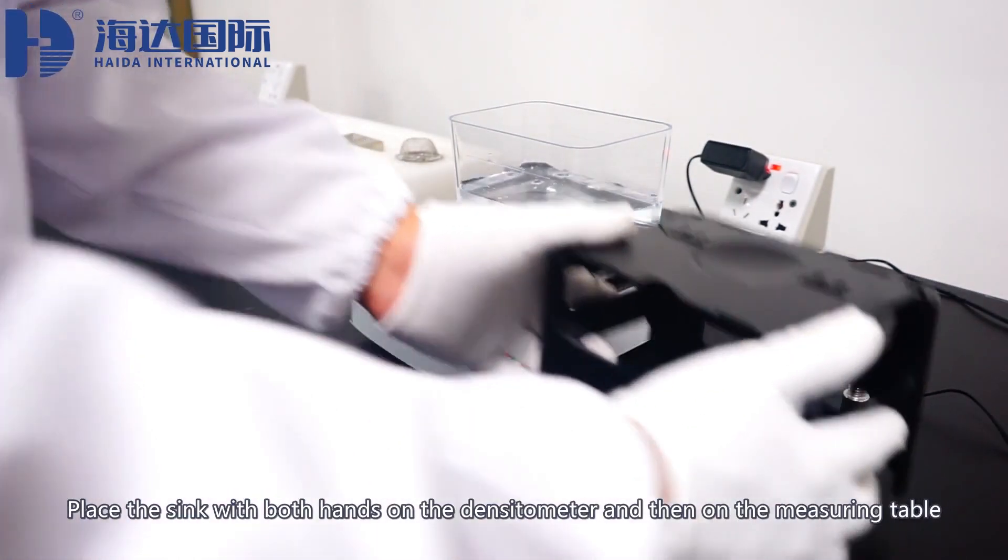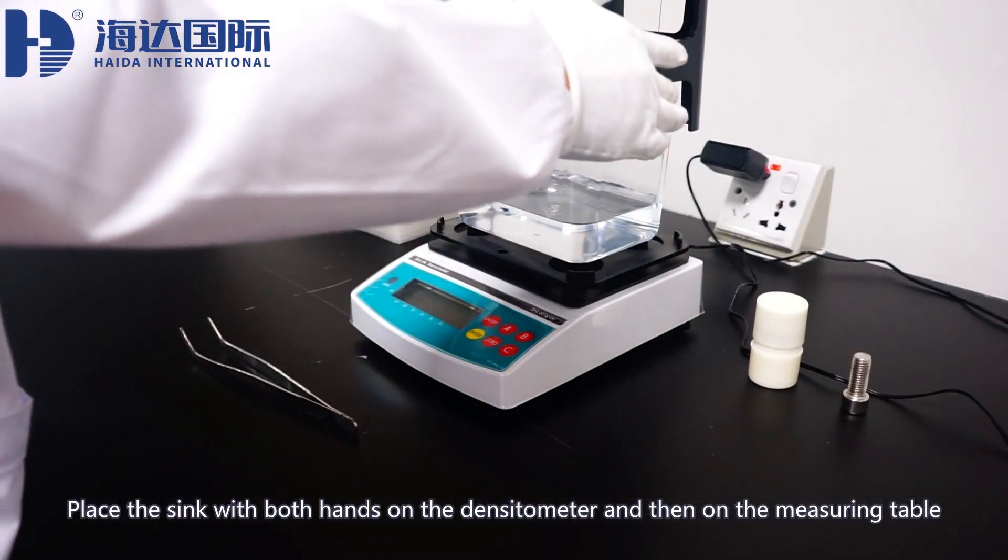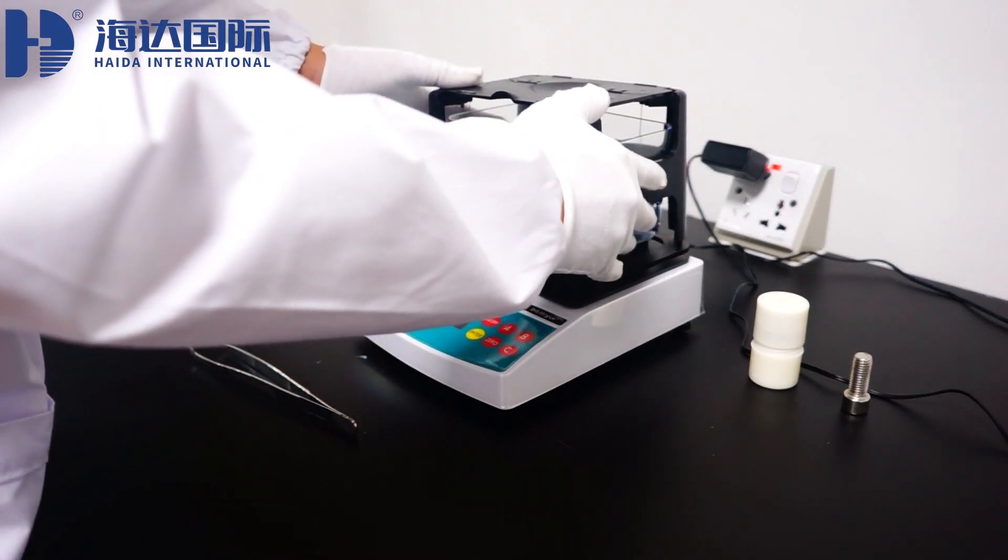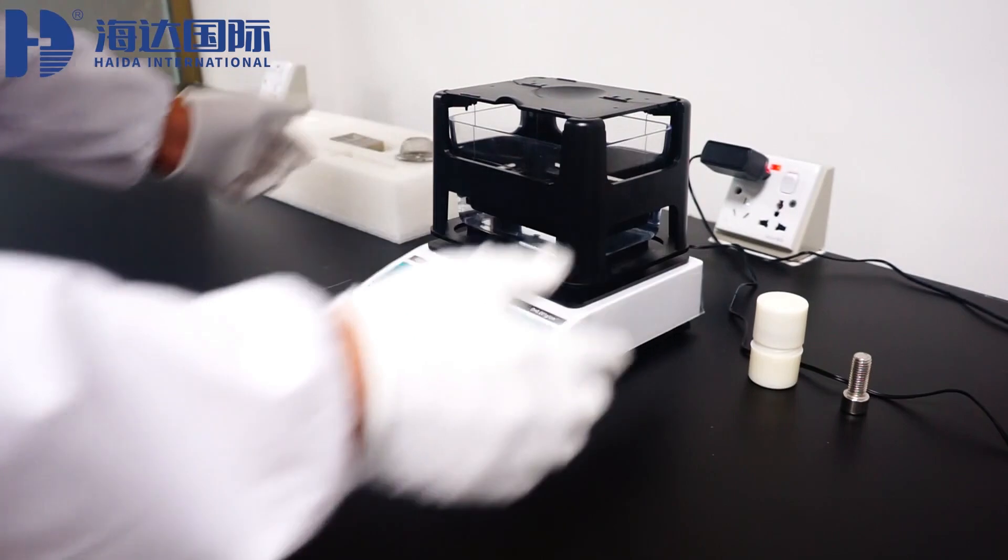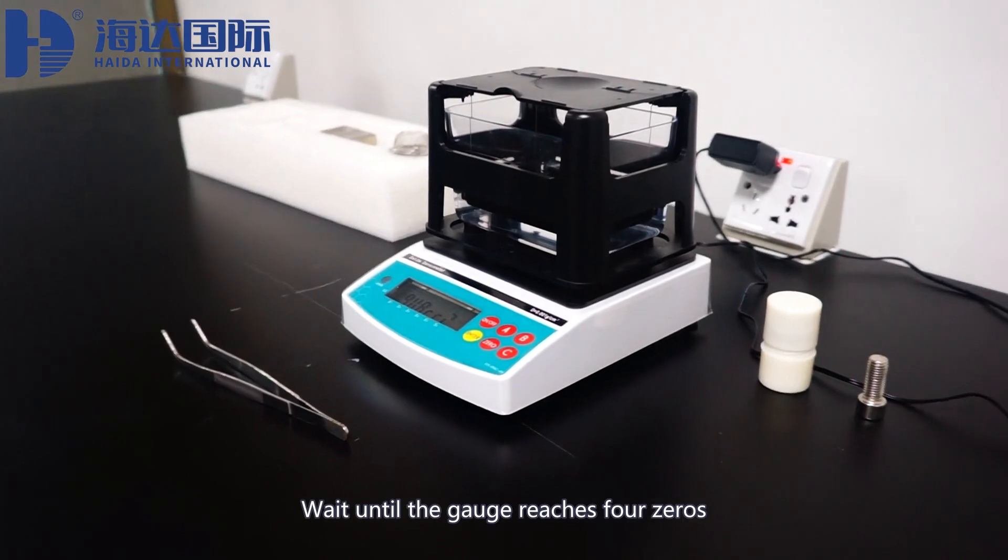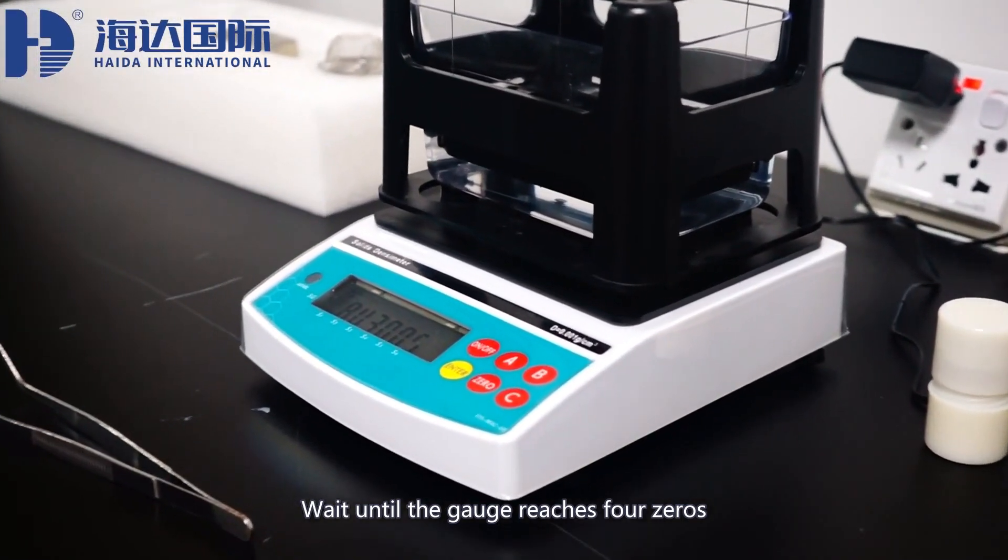Place the sink with both hands on the densitometer and then on the measuring table. Click the power on button. Wait until the gauge reaches zero.